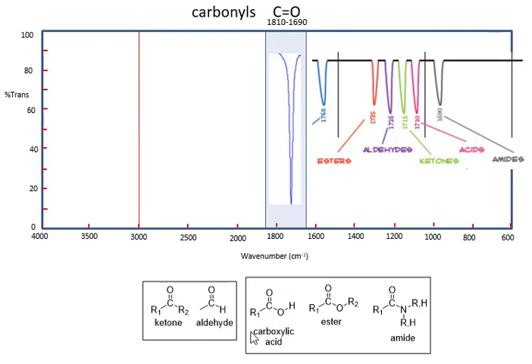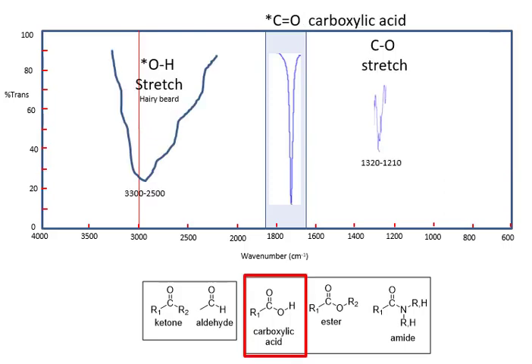And there's all kinds of functional groups that have a carbonyl, a ketone and aldehyde. We'll cluster those together. And the whole other group, carboxylic acids, esters, and amides, in which I have a C double bond O, in which the C is then connected to either an O or an N as well. So the actual position of the carbonyl bond stretch varies depending on which of these functional groups we have, but we'll always look for the C double bond O stretch in this region. So let's start and see where we might find the peaks for specific groups.